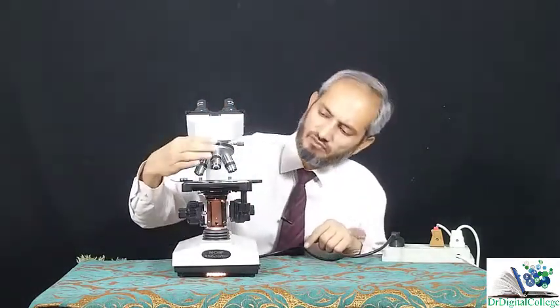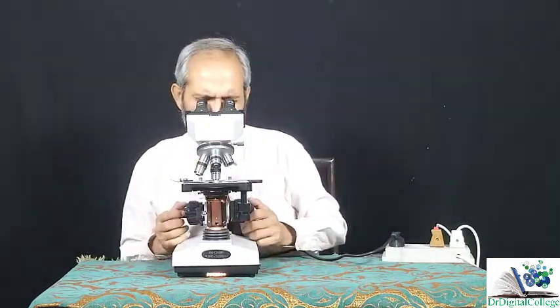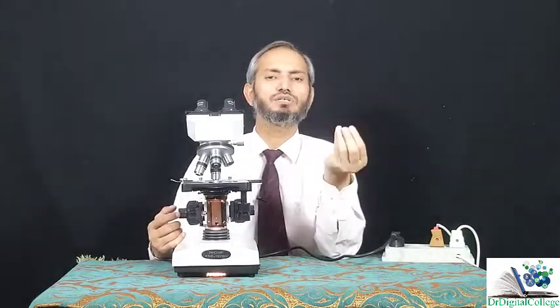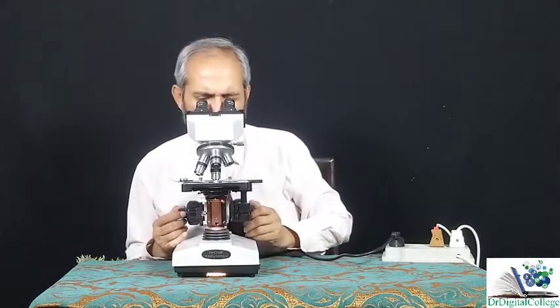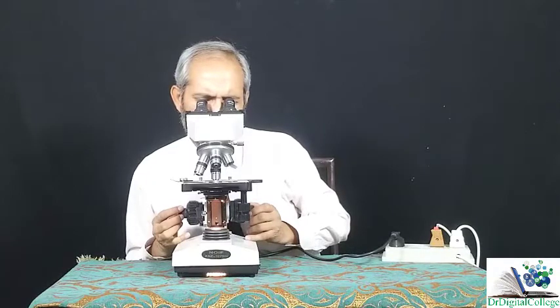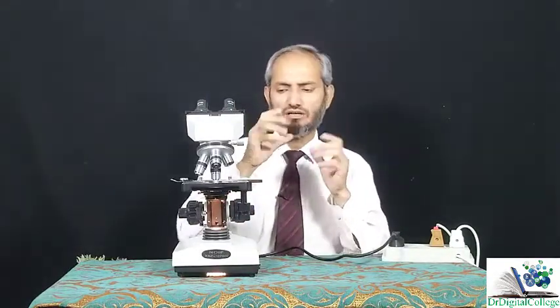Or even if I change it to blue, my object is still focused, but its resolution is now very low. Now you will have to adjust the resolution of your object. So if I adjust the resolution with the smaller knob like this, now every cell of my object is observable. I will show you through the camera what the image of this is.